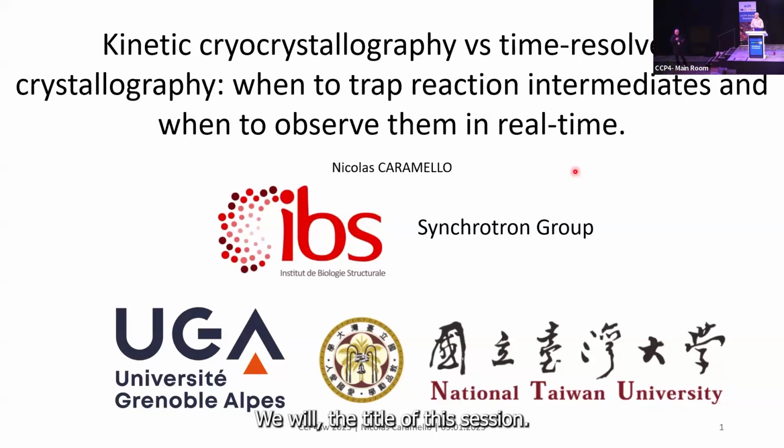The title of this session 7, the last one for this meeting, is More Ways to Characterize Your Sample. We'll be hearing about kinetic crystallography, time resolved. We're going to hear about placing fragments using anomalous signal, neutron diffraction, and also quantum refinement. So a little bit changing your gears over the afternoon, but I think really interesting.